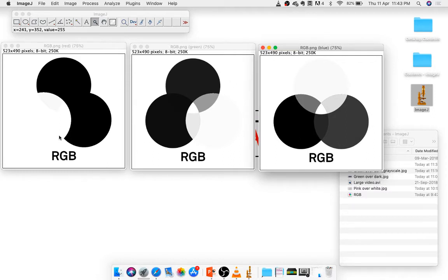Okay, so now you can see that this was red, by the way, this was green and this was blue. So on a grayscale image, because this is only looking at red intensities, red will be highest near to 255. Again, look at numbers that appear here. Whereas green and blue on a red scale should be close to 0. And that's why you see a value of 0 here and a value of 0 here. Similarly, here the green value shows up as white, which is 251, and others will be very close to 0. And similarly for blue over here.